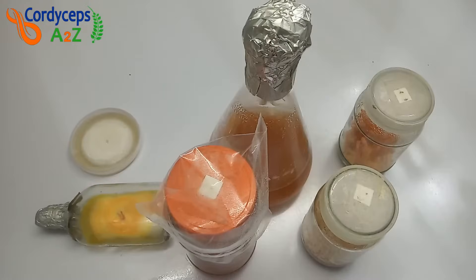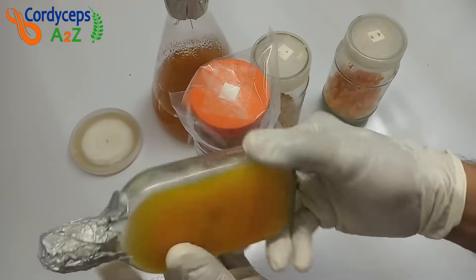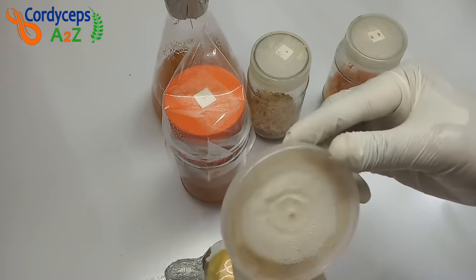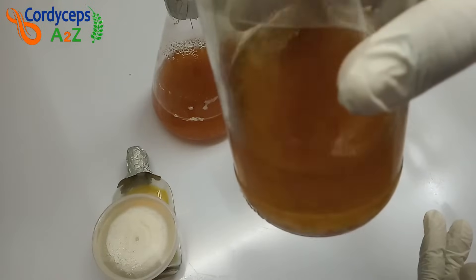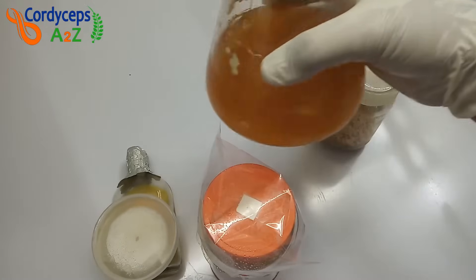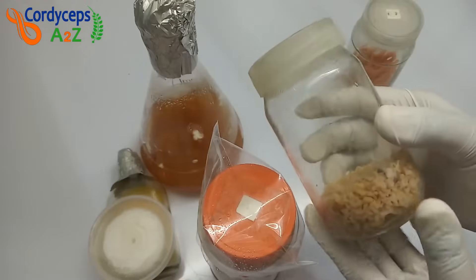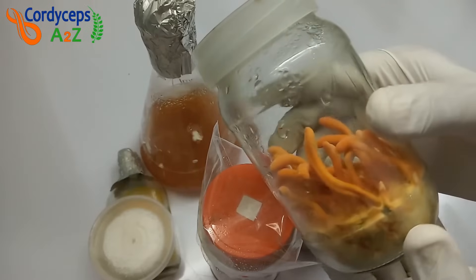Cordyceps militaris mushroom is grown in three different levels, and for it we need three different media. First is Potato Dextrose Agar (PDA), which is solid form of tissue culture — I will show you how to grow tissue culture in a glass bottle, though generally a petri dish is used. Second is Potato Dextrose (PD), which is a liquid form of tissue culture — I will show you how to grow liquid tissue culture in a glass jar; you can also use a conical flask. Third and last media is substrate, on which the Cordyceps militaris mushroom fruiting body will grow.